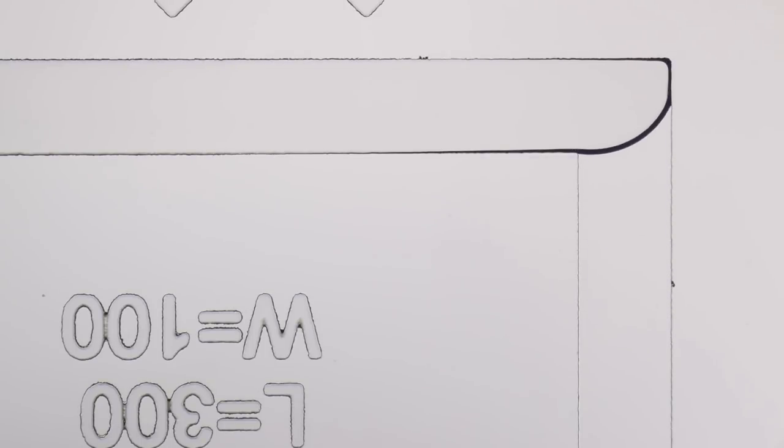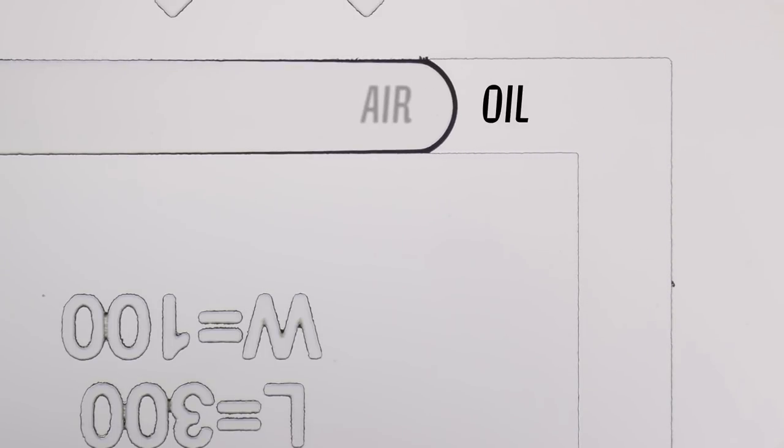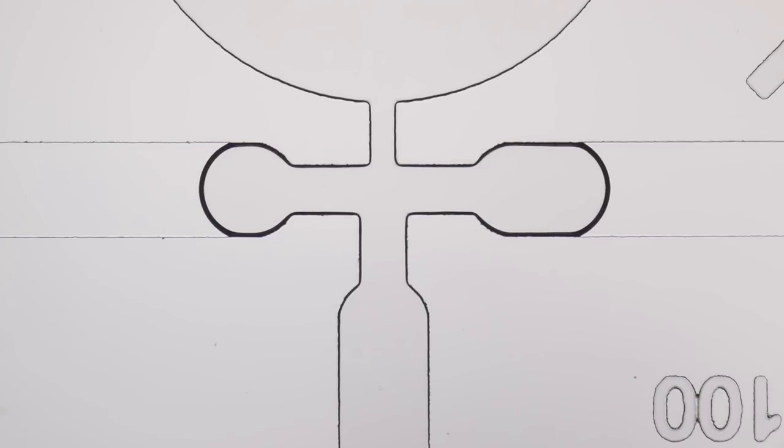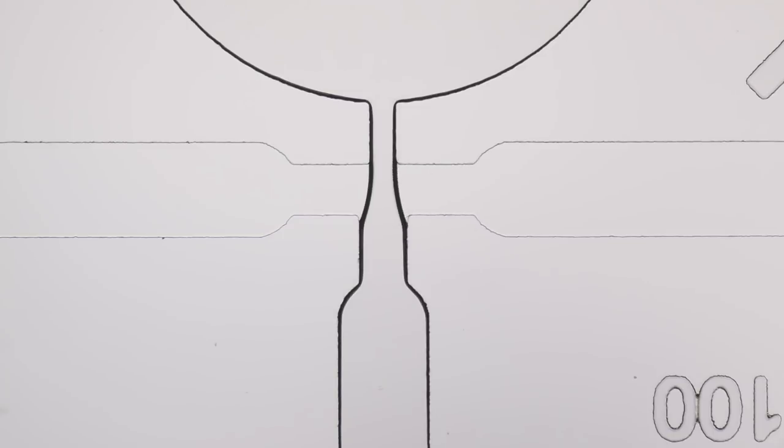We'll begin by sending the oil in. This is what's happening through the microscope. The oil pushes the air out of the channel it's filling up. And that's where the flow focusing will happen. We can see the oil arriving in the two lateral channels, then invading everything.